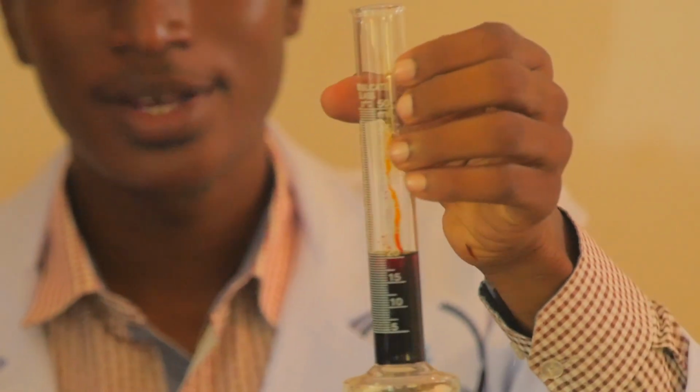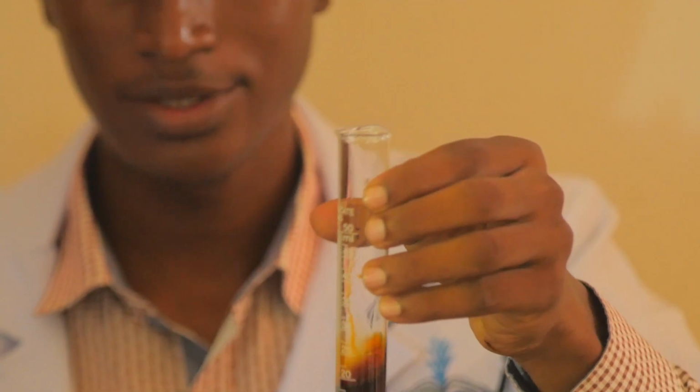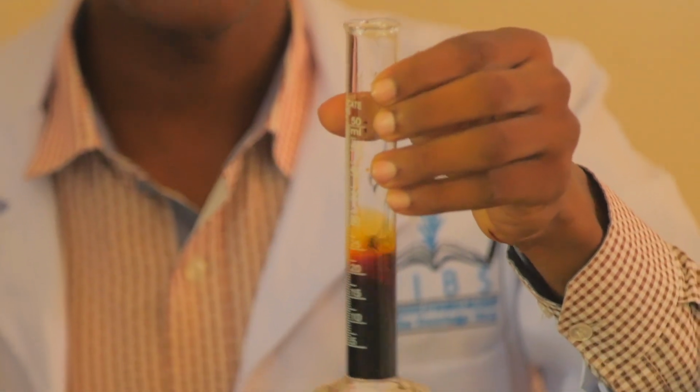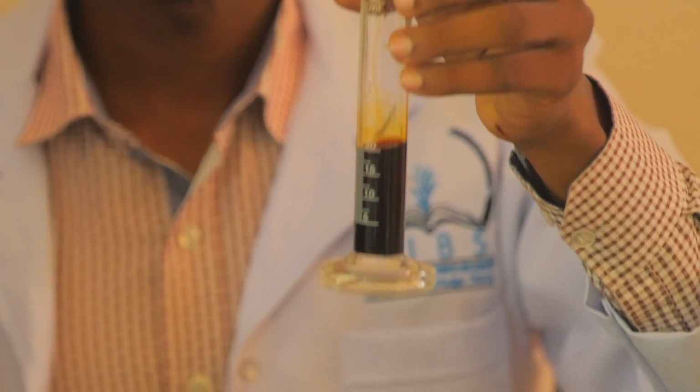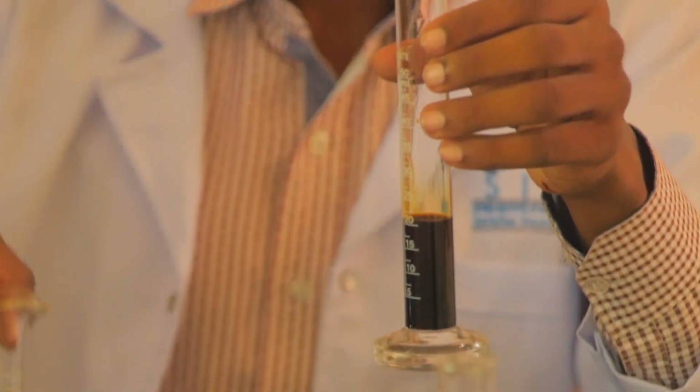So when you read the meniscus, this is exactly 20. So you shake all the preparation until it mixes fully, and these are 20 mils of iodine solution.